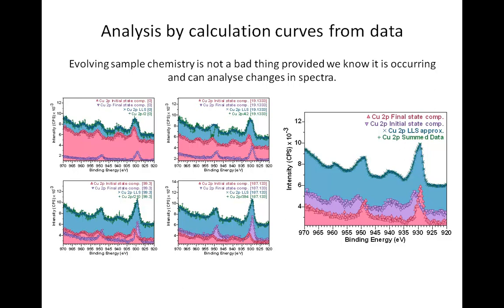Here we have an example where the data set that we've just looked at has been analysed and two spectral shapes have been determined from those data, which are then fitted to each and every spectrum within the data set and produce results that you see here.